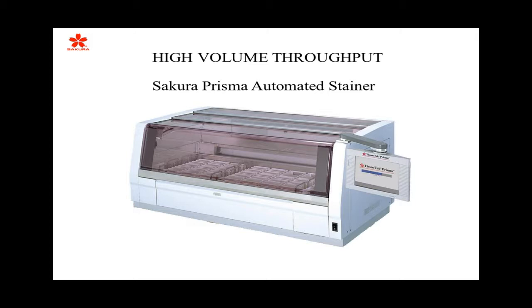Rinsing is very important, as I said before, so that you don't have carryover of reagents. Carryover of reagents is going to change the pH of your solution. So we want to minimize any carryover, and certainly rinse steps are very important.